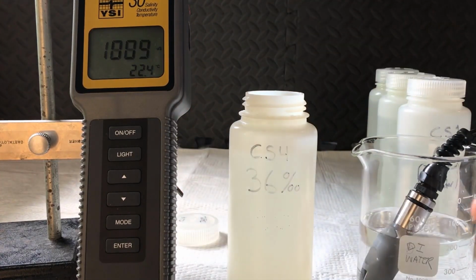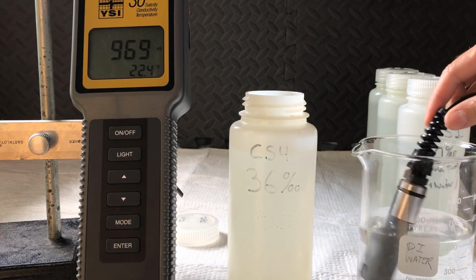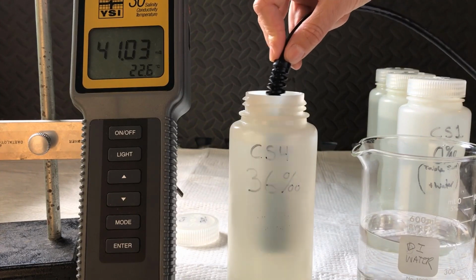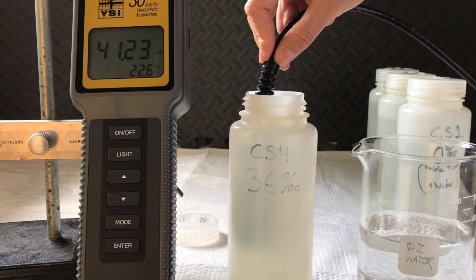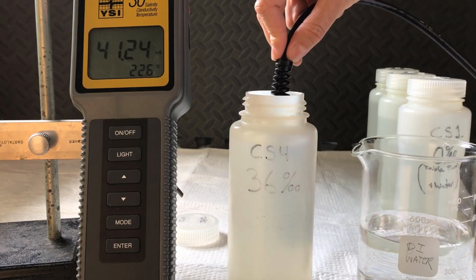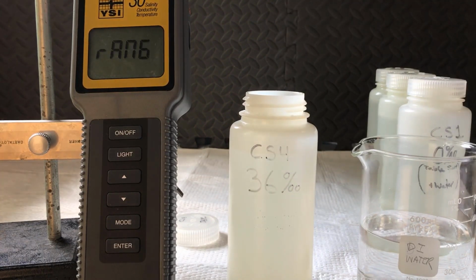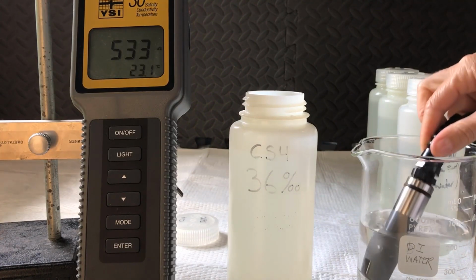Calibration standard 4 has a salinity of 36 parts per thousand salt. So the conductivity of calibration standard 4 is 41.24 millisiemens. Pause the video here and complete part A of your lab before moving on to complete part B.